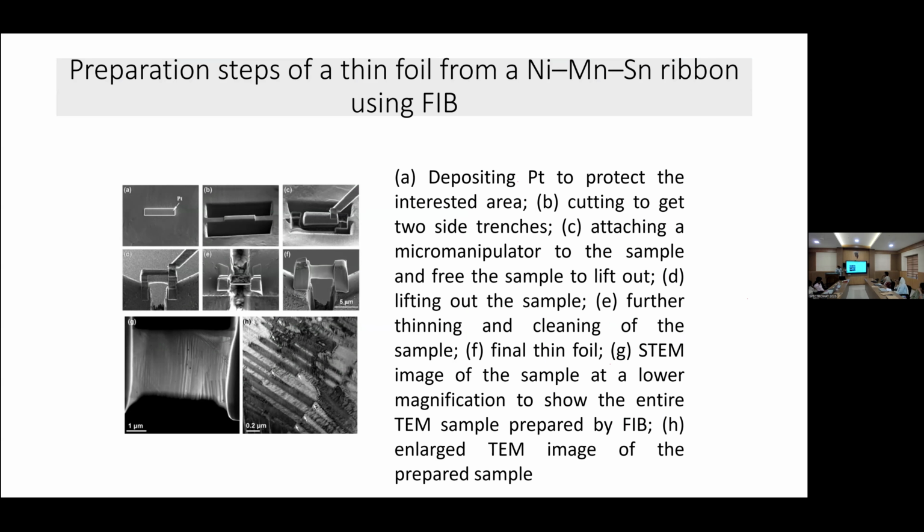Okay. This is also very costly equipment. It's about 3-4 crores if you want to go for the dual beam FIB. The transmission electron microscope technique is not very common only because it's very costly. That's why. If you want to set up a TEM lab, you need to spend nearly 6 to 14 crores for a normal TEM lab, because with all those sample preparation techniques, otherwise we cannot analyze some of the samples from your lab. That depends on what work you are doing in your lab. Okay.